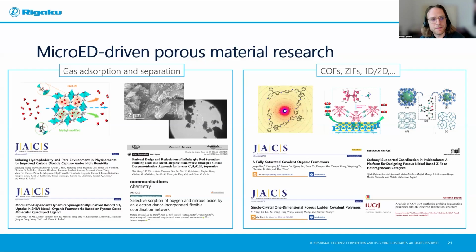And I would say there's a bit of a micro-ED driven research now, because you can explore whole new synthesis pathways, which previously would have been inaccessible because you just couldn't understand what you get in the end. And now this is totally made possible and is becoming a routine technique in the toolkit for MOF research and similar. But there are, of course, many other communities that benefit from it a lot.